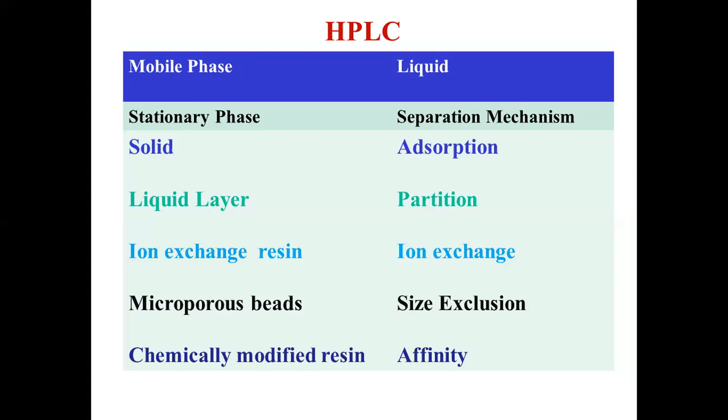In HPLC, a liquid mobile phase will be used. Therefore, this can be simply called liquid chromatography. The mobile phase we are going to use in HPLC will be liquid in nature, and therefore this belongs to the liquid chromatography technique.